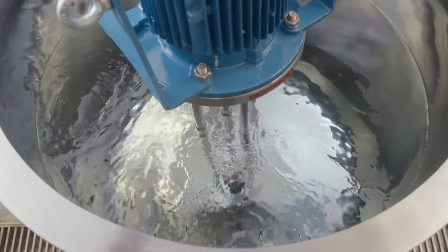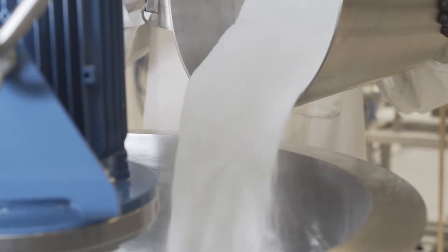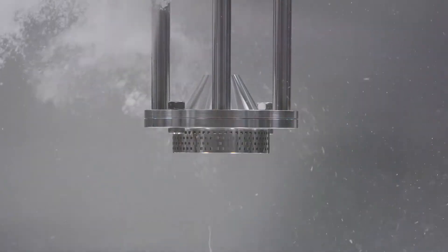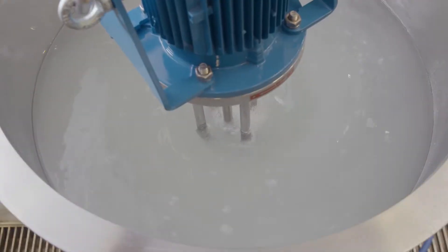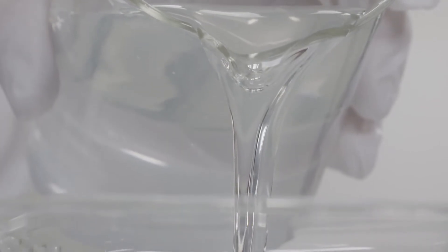We're going to show you how to make up a PVA solution the Silverson way. With a Silverson high-speed, high-shear mixer, you can disperse the PVA into hot water, a major saving in processing time. The powder can be added as rapidly as the machine will take it in. The powder and liquid are drawn into the workhead and subjected to intense high shear before being projected out through the holes in the stator and back into the mix. This finally disperses the powder, ensuring rapid solubilization of the PVA without any agglomerates.